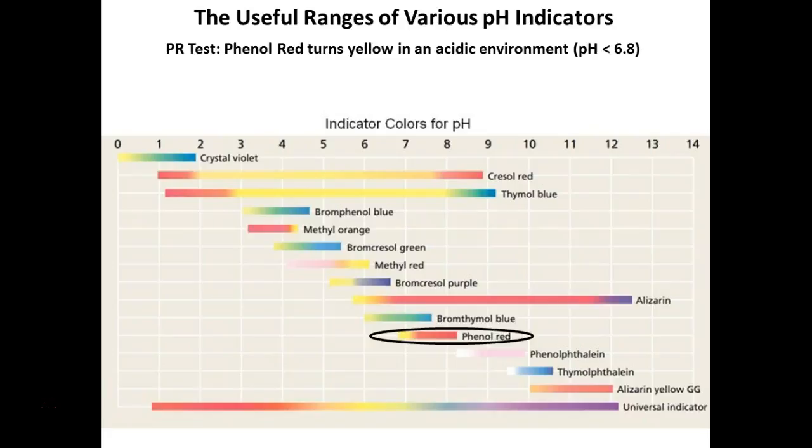Still with me? So the important thing that we're trying to show you here with these questions is that we're using two different pH indicators that have two different pH ranges. With the methyl red, we want to know, is it very acidic? Whereas the phenol red test, we want to just know if it produced some acid. Did it ferment a little bit? Even just a little bit.